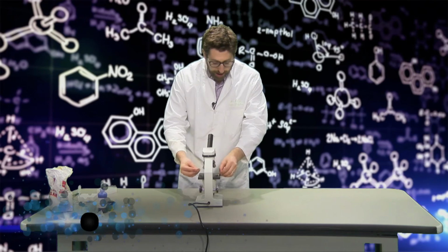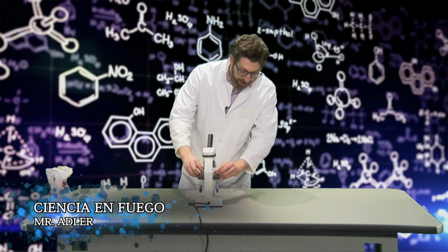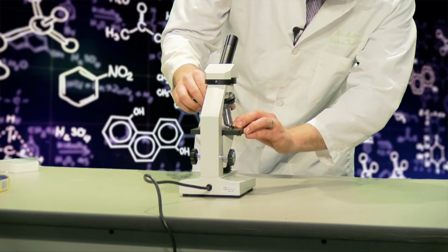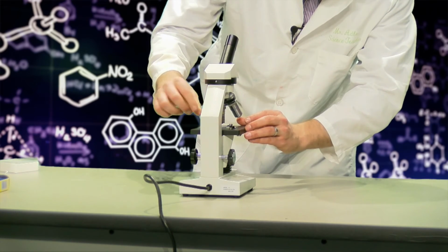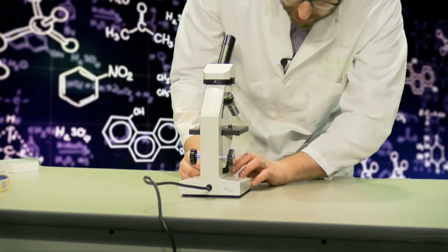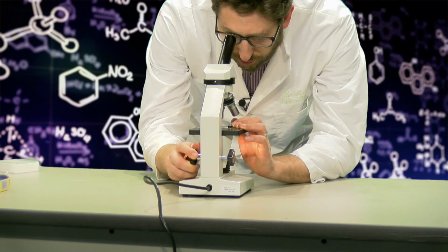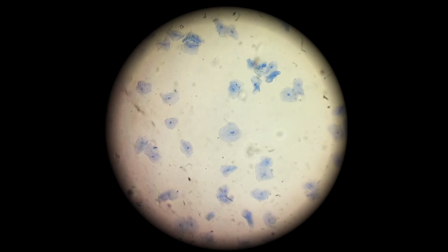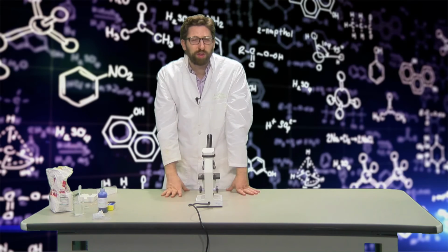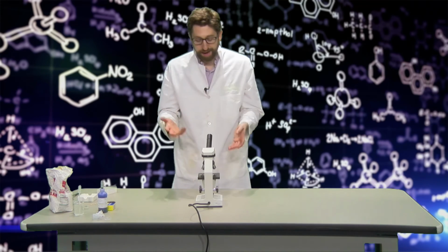I'm going to take my slide, put it down, make sure my sample is right in the middle, and remember what I said last time, we always start on low power. Turn on my light, and let's see what I can bring into focus. I turn the focus knob and, oh man, there's definitely something there. I can't see it really well though. What am I going to have to do? I need to go to higher power.